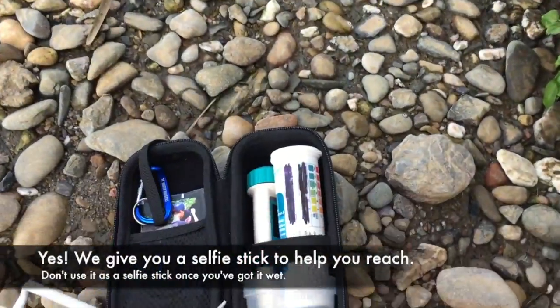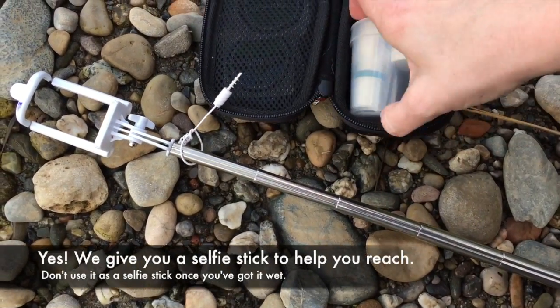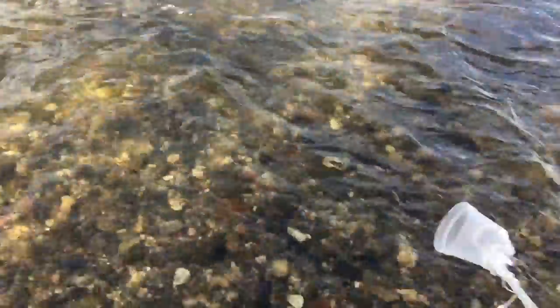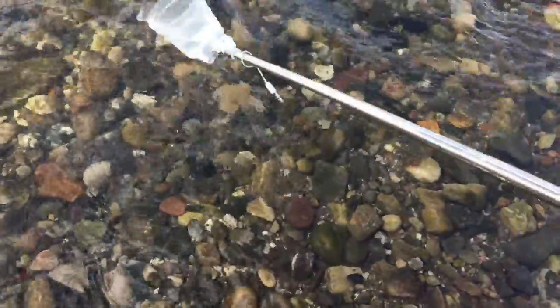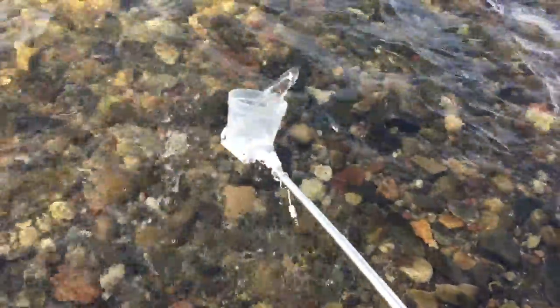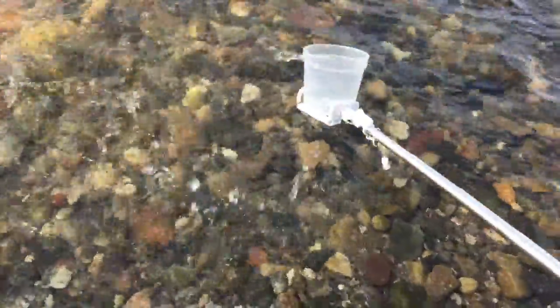I've got my selfie stick and I'm going to get my cup out. I'm assuming this river is not clean so I'm not going to go into the water, but I'm still going to do my sample. Rinse your cup three times — that's especially important to rinse for me because I was testing the Mediterranean, so this thing is quite salty.